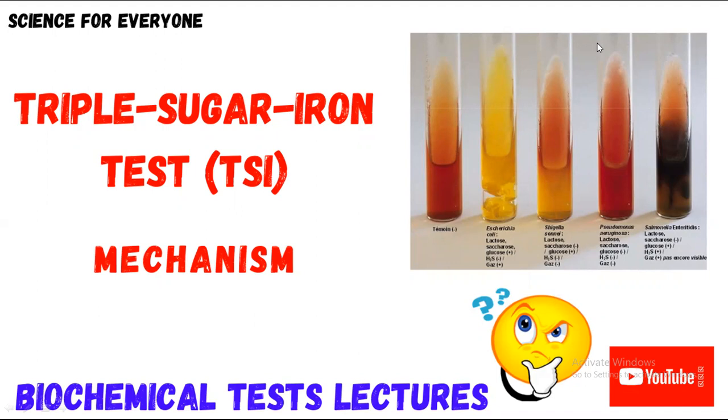Today the video is related to microbiology, and the title of my today's lecture is Triple Sugar Iron Test. And what is basically the mechanism of this test? Basically, triple sugar iron test is a biochemical test that is used for the identification of different microorganisms, and it is used to differentiate between different microorganisms.